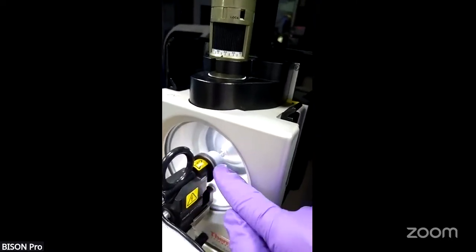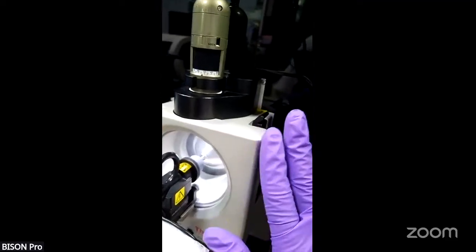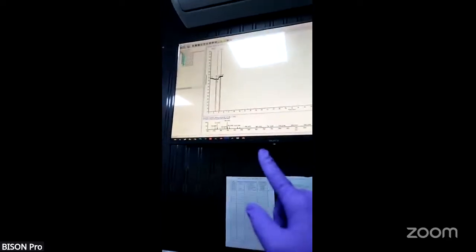The samples which are injected are bombarded inside. Once bombarded, they go to the Orbitrap, or the mass analyzer. The mass analyzer analyzes the proteins, and you can see a chromatogram like that. So this is how a live sample run acquisition happens.